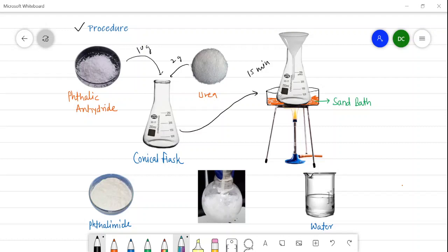When it is heated for 15 minutes, this phthalic anhydride and urea undergo reaction and they will form phthalimide, but there is formation of CO2 gas and this CO2 gas is bubbled out from the reaction mixture. From this solid product the CO2 gas is bubbled out, so instead of solid product here we get a foam-like compound, and it is nothing but frothing of mixture. In Marathi it is called as phase.